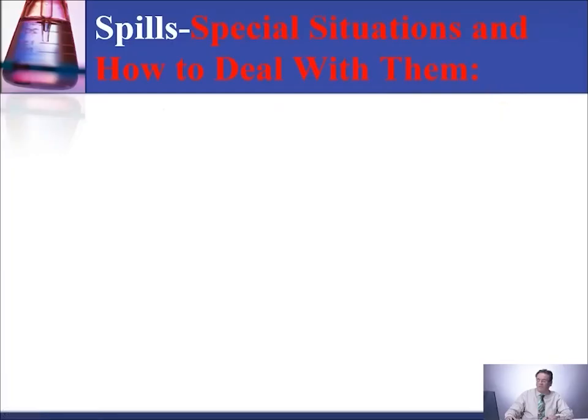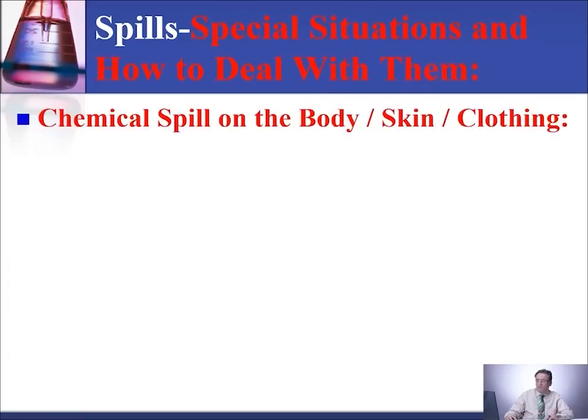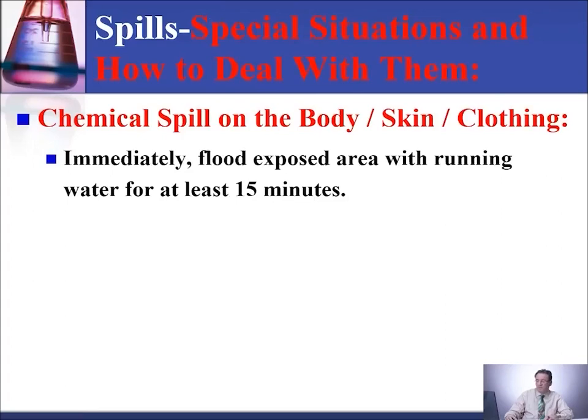Next, I'm going to talk about special situations and how to deal with them. These procedures are just for the things that I'm going to be talking about, and in general, they cannot be used for something else. So, chemical spills on the body, skin, or clothing: immediately flood the exposed area with running water for at least 15 minutes.